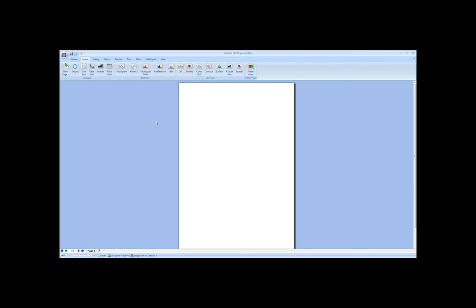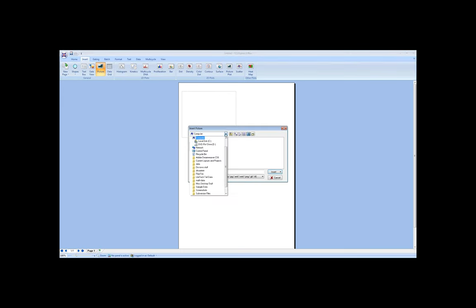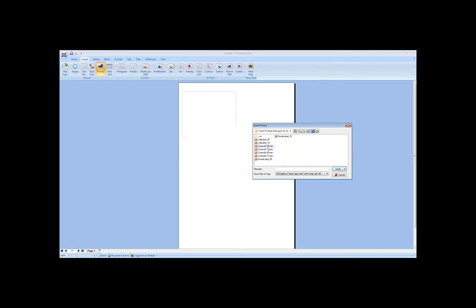And to do this type of thing, I'm going to start just by inserting a raw picture, so you get an idea of how this looks and feels. If I wanted to insert a picture, what I could do is click on the Picture button here, draw a box on the layout where I want that picture to be inserted, and then I can go to my computer here and I can choose where that picture is. And I happen to have a set of images here. And these are the raw images from my image cytometry experiment that I want to show you today. So I'm going to choose this Channel 1 5-minute image, and I'll click Insert.